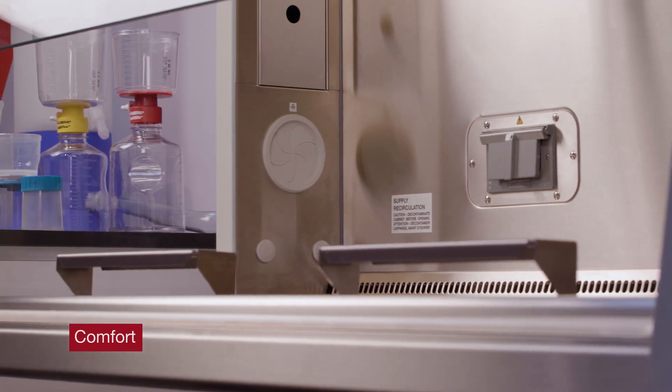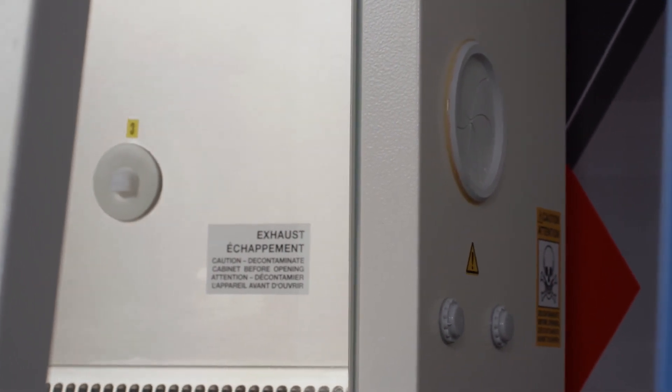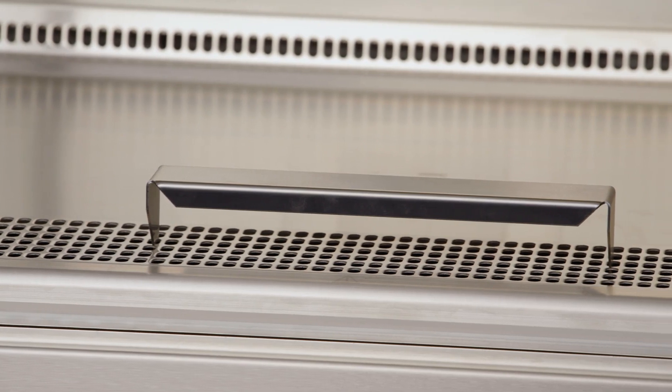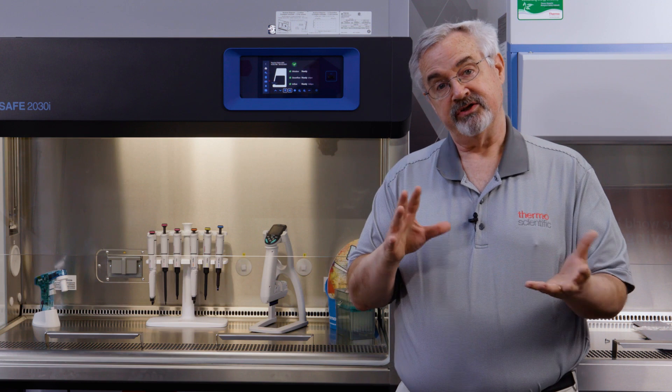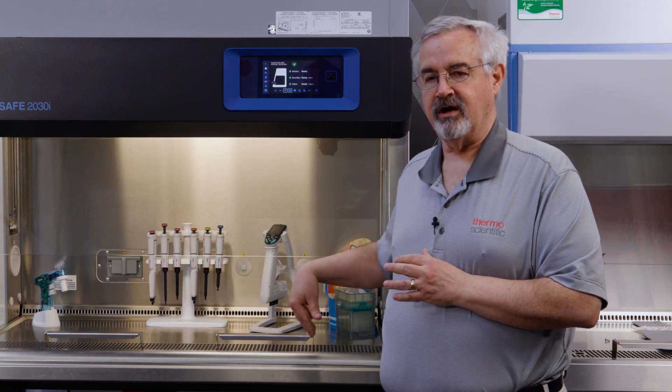Comfort, or ergonomics — this is probably the most ergonomic cabinet from an enjoyable aspect. It has transparent side walls, so it's a much more open feeling as you work within the cabinet, which is very helpful in teaching applications. It has a motorized window, so it's very easy to raise and lower. It has our over-the-grill armrests that provide ergonomically supported reach into the work area. We have an indented work tray, and on this unit we actually have disposable gel pads. You can wipe them down regularly for disinfection, and every so often you can replace them and put new pads in place for more comfortable use.